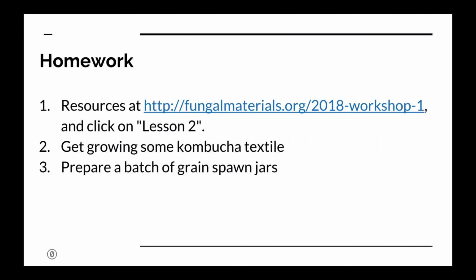Prepare a batch of grain spawn jars. With the mycelial materials, this is kind of more of a slow march. Last week we made the airport lids. This week we're going to use those to make the grain spawn jars. And then next week we'll start potentially being able to actually use those to make more fungal materials. When dealing with mycelial materials, there is more that goes into it than just kombucha, which only requires making tea.